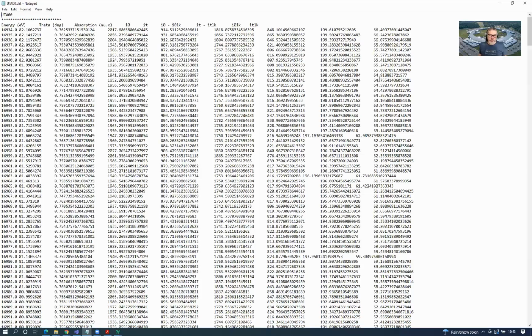So the component data files that you use to produce the absorption in this case. Okay, so the I0 and the IT will be the merged data files in this case to give you the counts, and similarly for the I0 leakage and IT leakage, these will be the counts determined by the polynomial fitting.